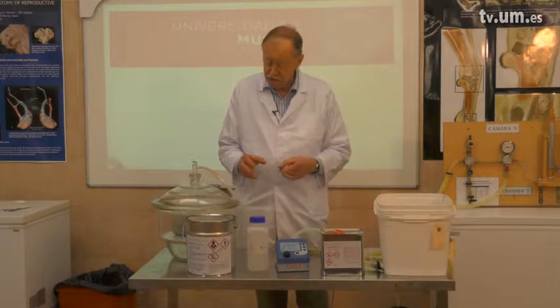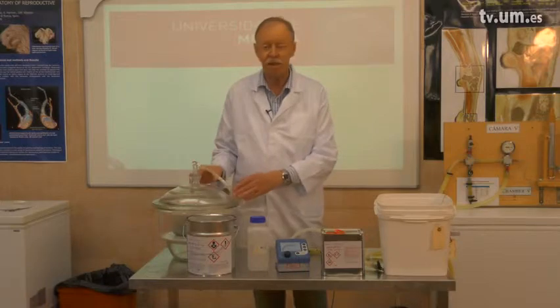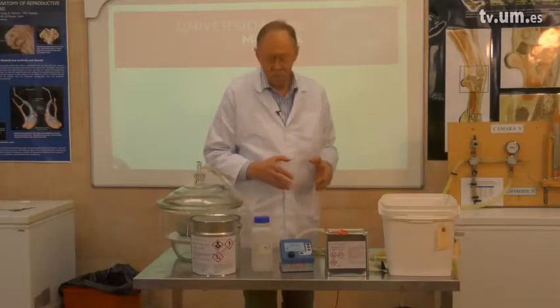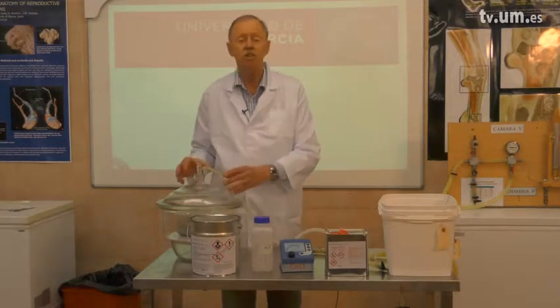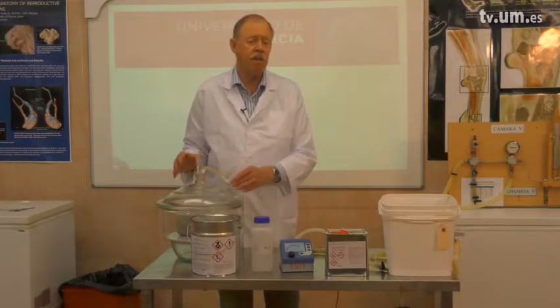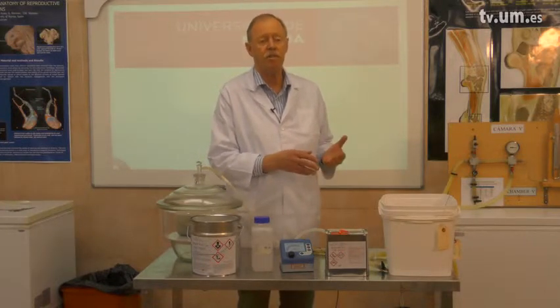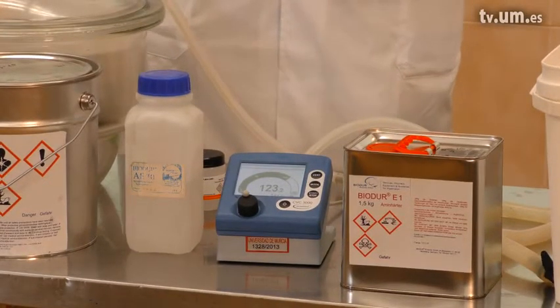After the impregnation, we take out the specimen from the impregnation bath and we start the casting. The impregnation is finished when we don't see any bubbles anymore, and it will be achieved at a remaining pressure of five millimeters of mercury — so almost a vacuum.